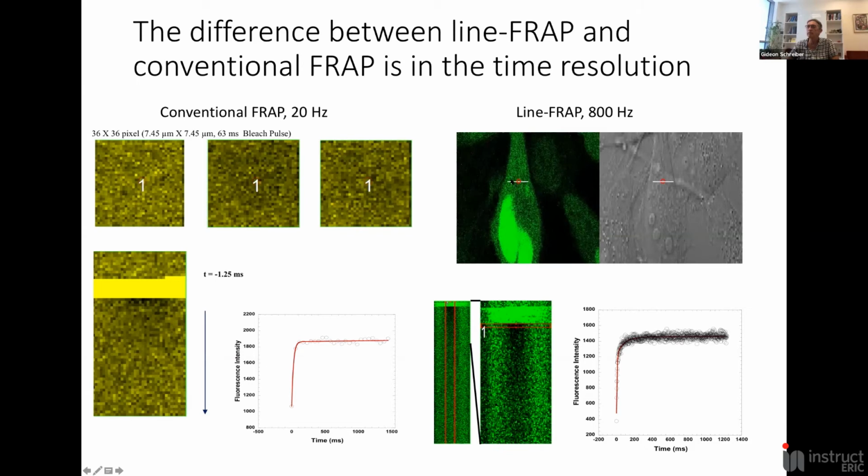And the problem is that if we speak about half recovery rates, the half recovery will happen very often for rapidly diffusing molecules like proteins in about 100 milliseconds. So this is an example here of a recovery.